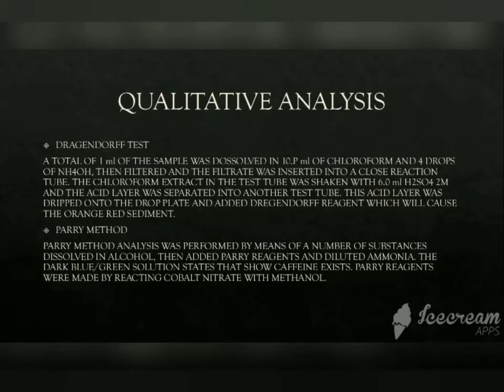For Dragendorff test, a total of 1 ml of sample was dissolved in 10 ml of chloroform and 4 drops of NH4OH, then filtered, and the filtrate was inserted into a closed reaction tube.